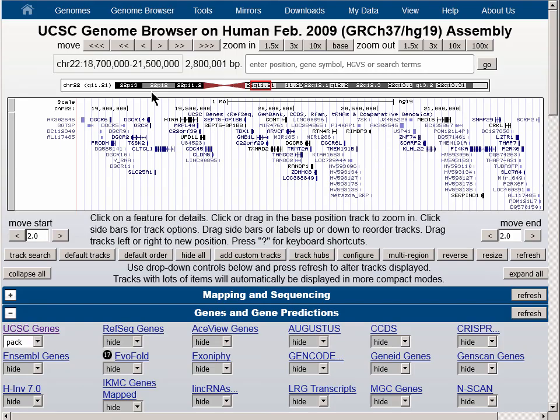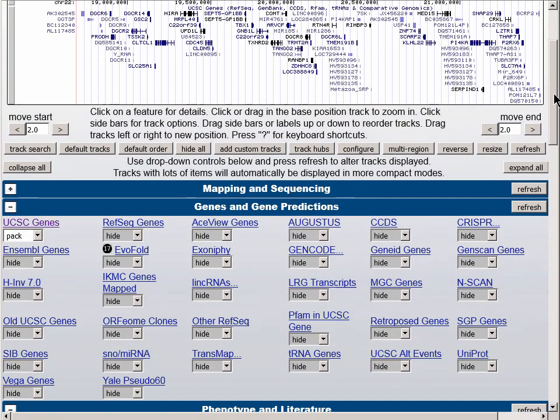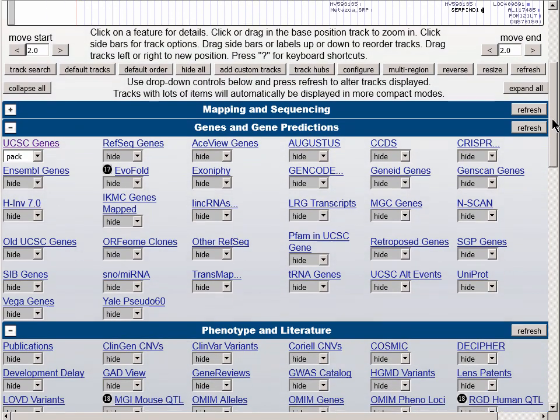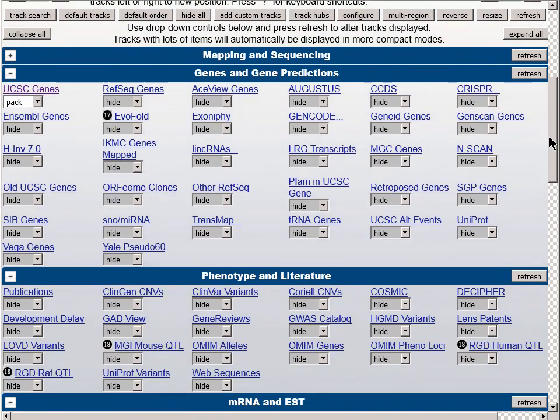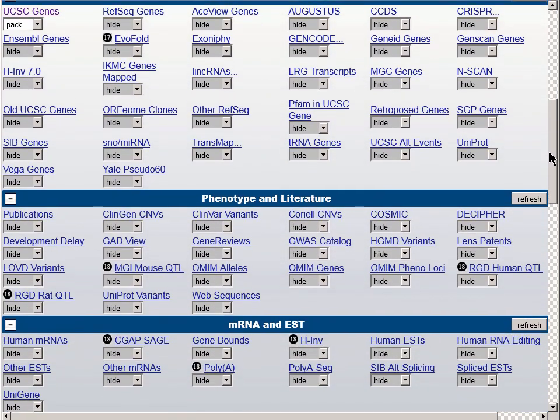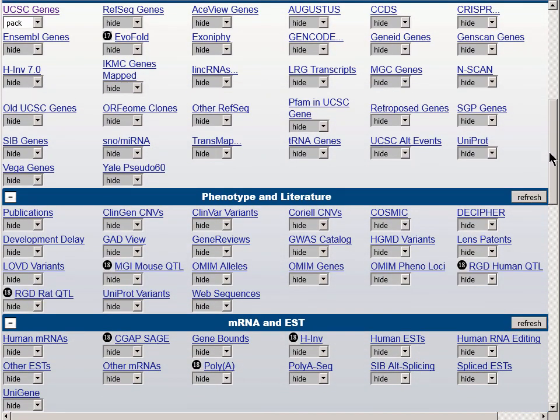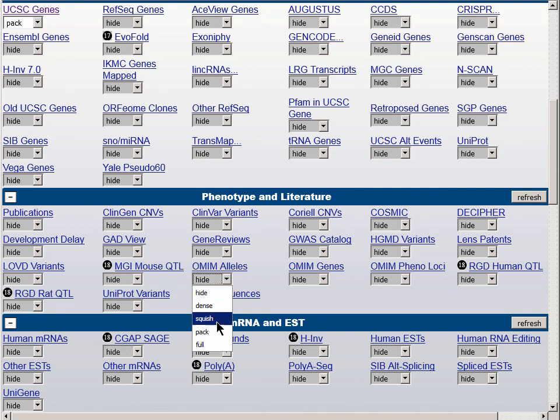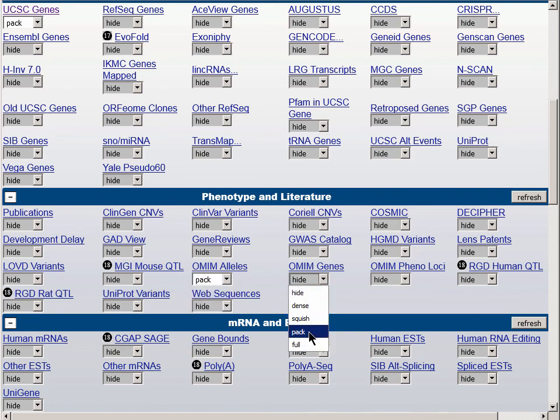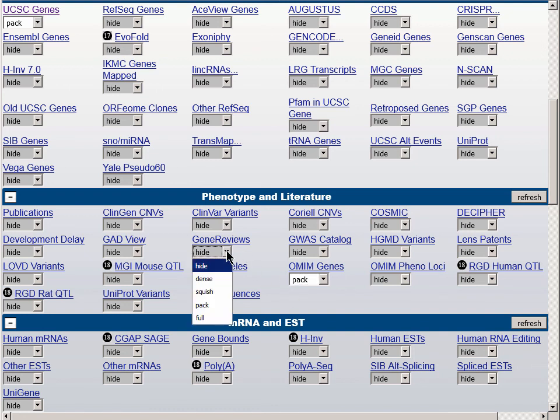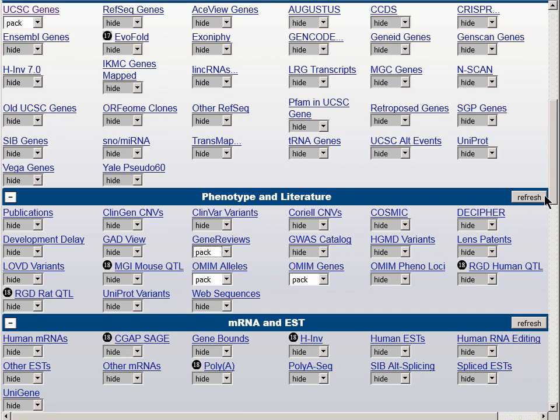Let's turn on a couple of data tracks now that represent information about the phenotype of the genes in question. We'll scroll down the page to the blue bar group Phenotype in Literature, and we'll turn on the OMIM Alleles Track to Pack, and the OMIM Genes Track to Pack. We can also turn on the Gene Reviews Track to Pack, and then the Refresh button will give us these three tracks turned on.